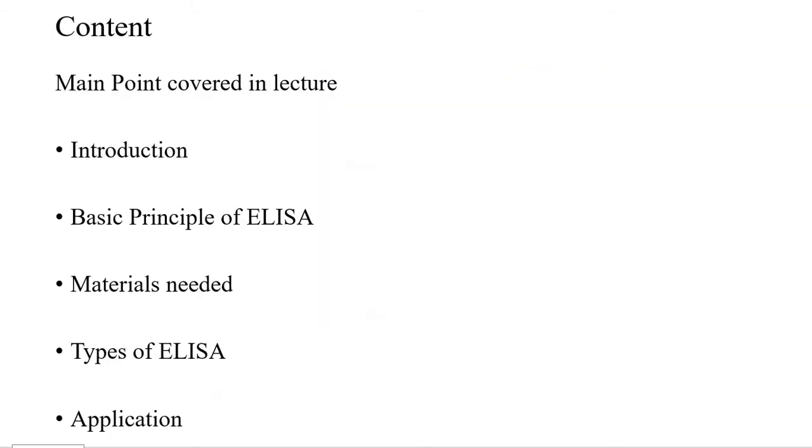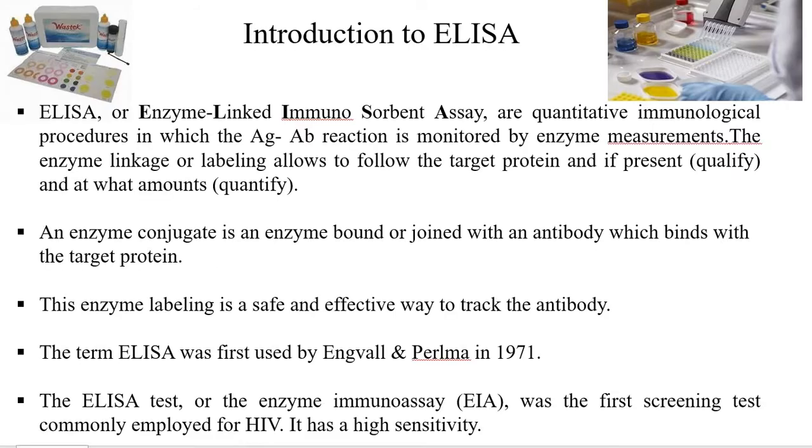This talk is divided into the following content: introduction, basic principle of ELISA, material required for ELISA, type of ELISA, and an application part. Now we move to the next slide, that is the introduction of ELISA.